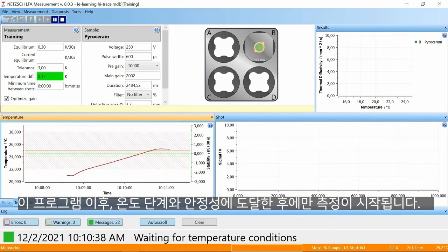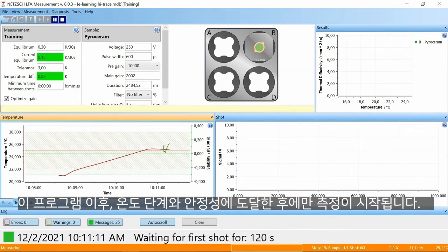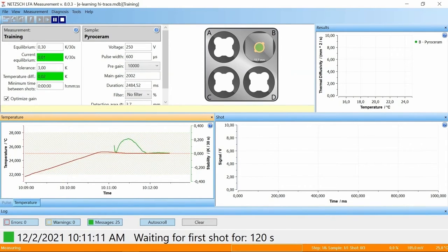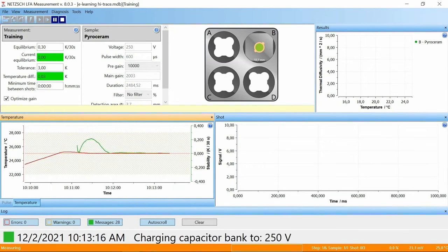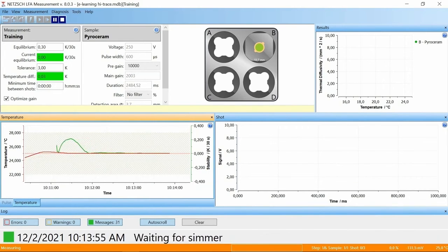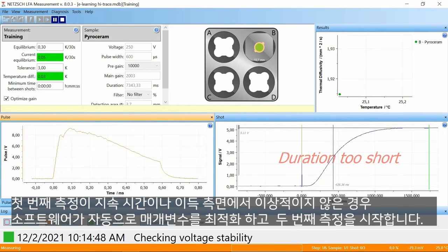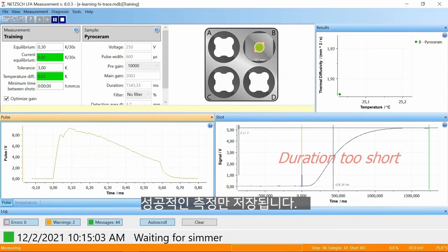Only after the programmed temperature step and stability is reached, a shot is triggered. If the first shot is not ideal in duration or gain, the software automatically optimizes the parameters and repeats the shot. Only good shots are stored.